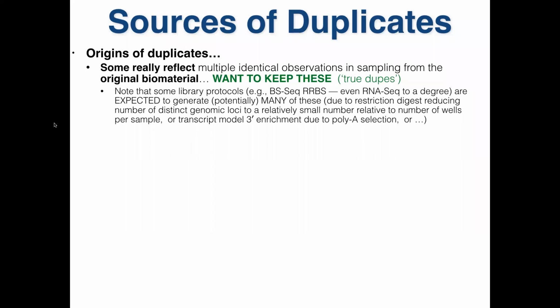And then the methylation state, which is reflected in the read sequence, is going to be the same for a lot of those reads. So you synchronize the location, and the methylation is mostly on or off. So all copies are all methylated, or all not, which means the reads are going to be C to T. And so you do expect a lot of literal duplication of data because that's the way the protocol is designed. And you wouldn't want to remove all duplicates, like take all groups of duplicates and replace each with a single representative.